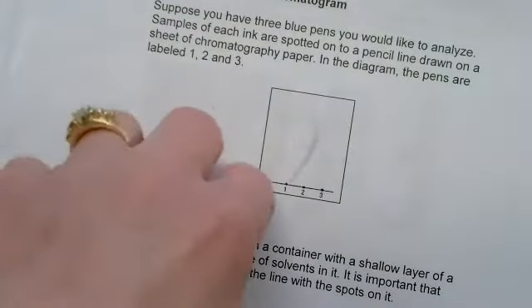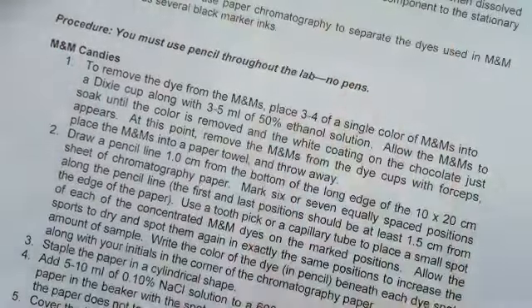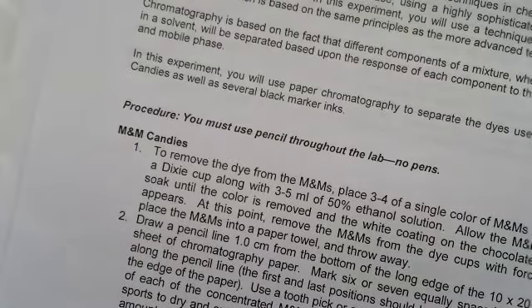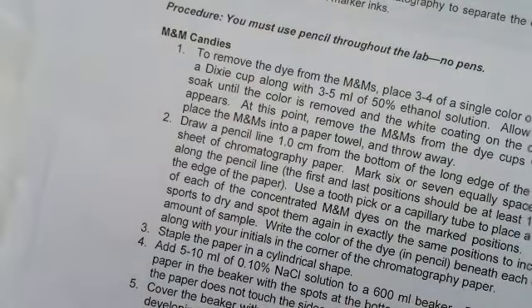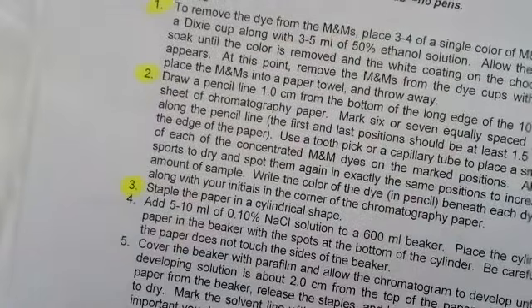Okay, so if we could now transition here. We're going to alternate between these two different packets. So just to jump right in, we're going to be separating food dyes and also marker and pen inks, looking at their different responses to stationary and mobile phase. And we'll talk more about that as we talk about the procedure. There's two things we're investigating. One are food dyes. So could I ask you now to read 1, 2, and 3, and then we'll talk about it.